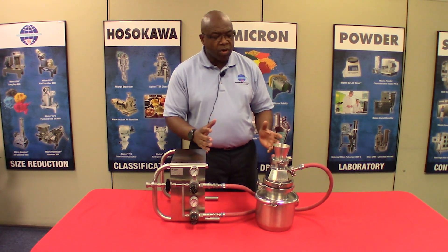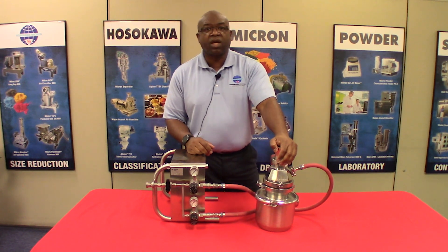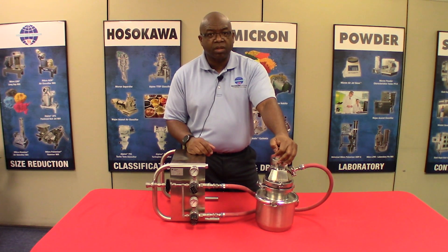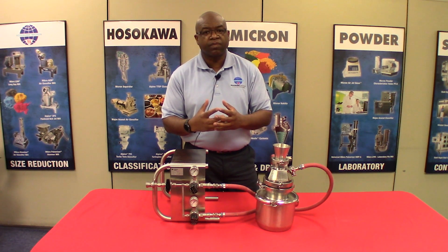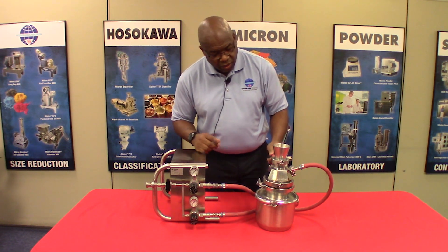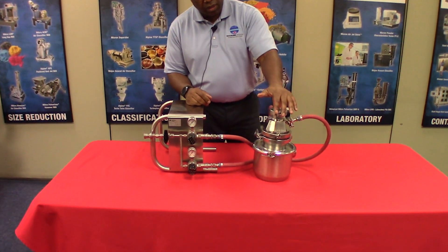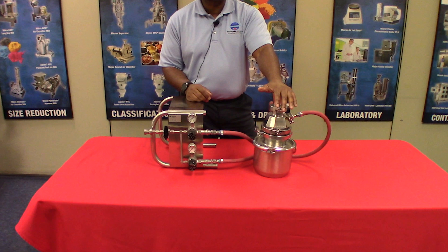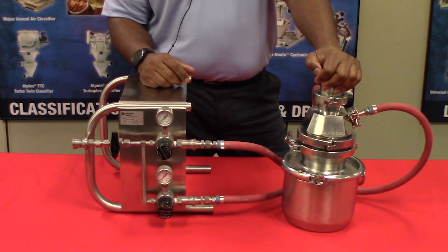There are no moving parts within this mill. Milling is done purely by particle against particle, and also by impact against the side of the chamber. During milling, the maximum pressure typically is about 6 bar, which is approximately 90 psi.